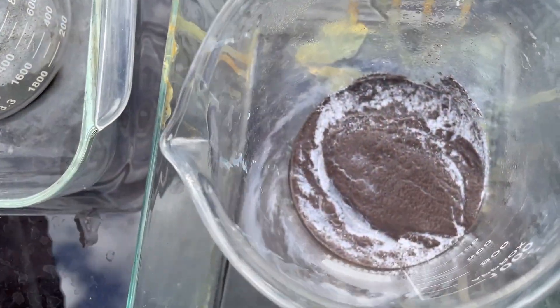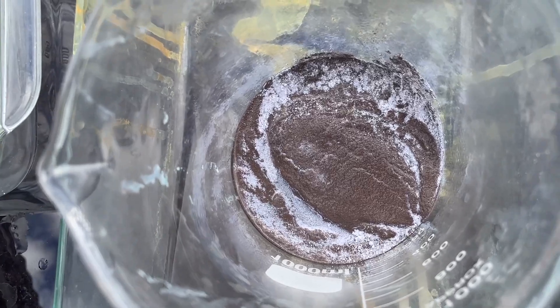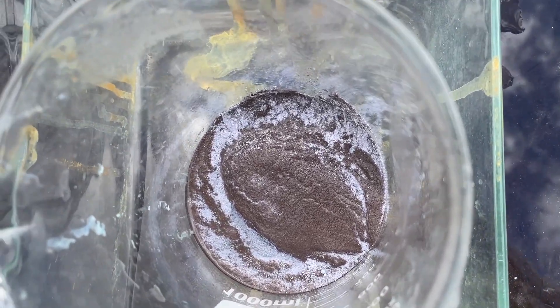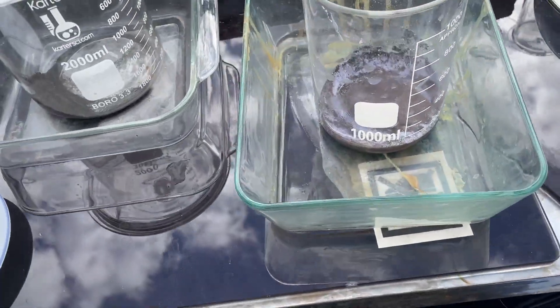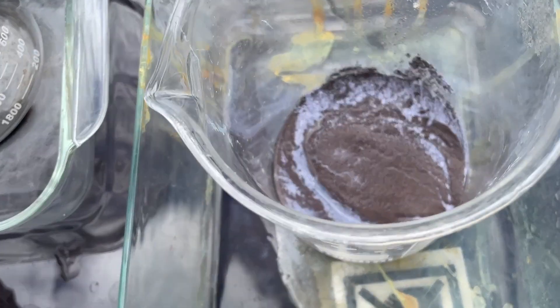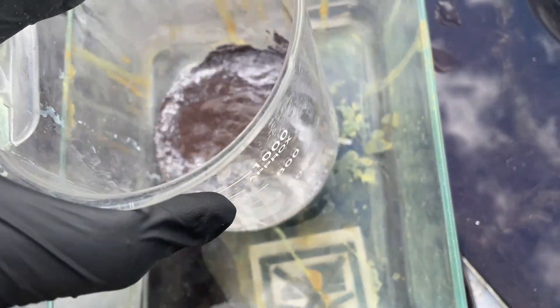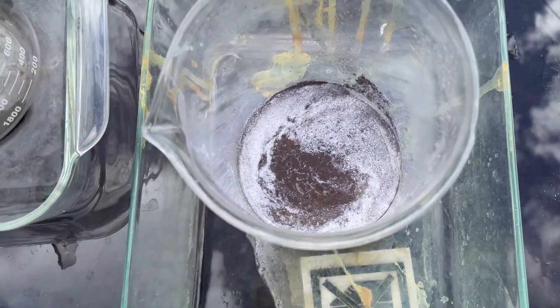We've got to add lye to that to convert it all the way to oxides, and then sugar. It's got a little water in there — that might be enough. Let's give it a shot. Yeah, that's what I did yesterday — I'm just going to put a little bit here and let it sit so we can eyeball the reaction.